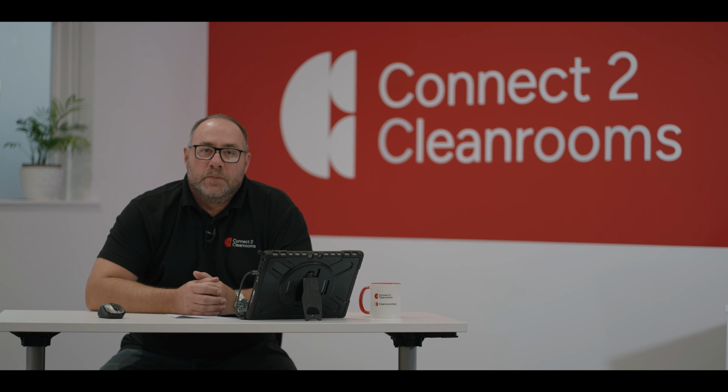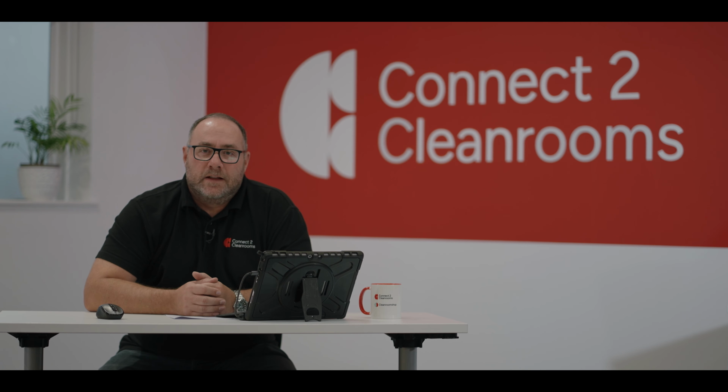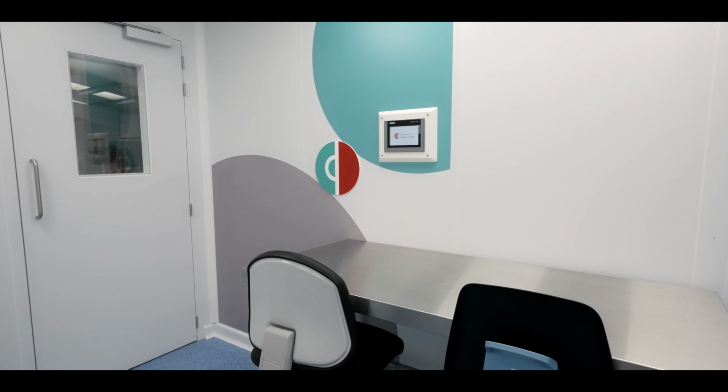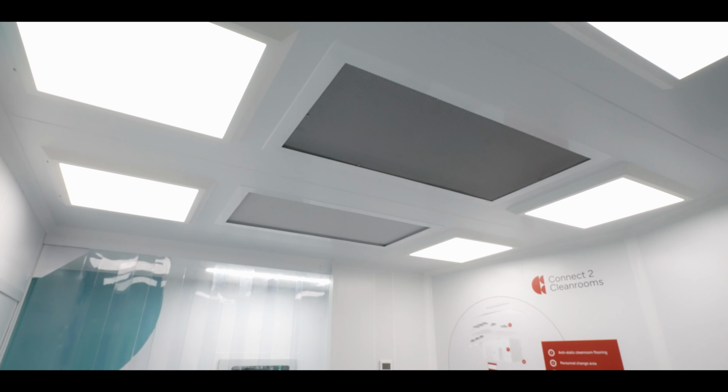Today we're going to be looking at the importance of cleanroom testing and validation. Validation of a cleanroom is just like getting your car MOT'd. It's an important process that includes a range of tests that are designed to ensure the cleanroom is operating efficiently and to the required standard.